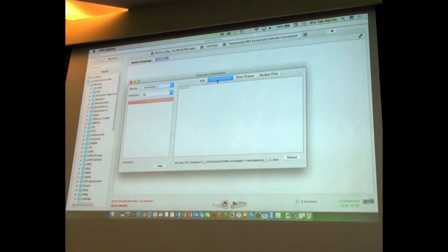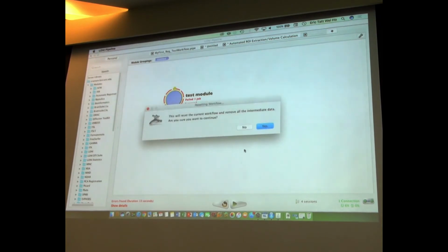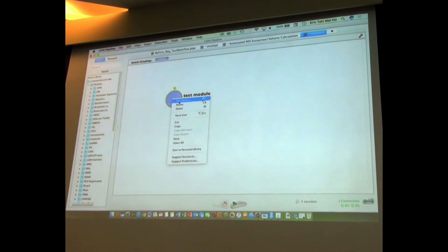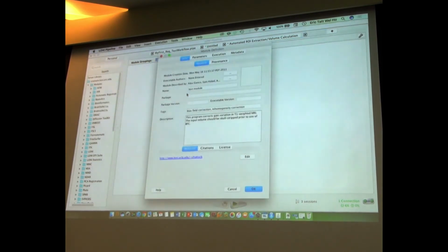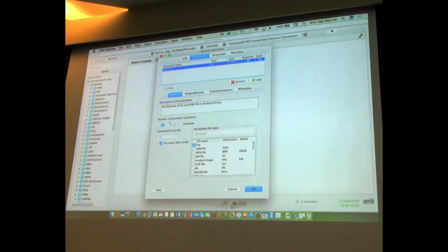That's why copy pasting does not work directly. What I did is I left in the flag of the parameter, which was not right. So I need to go back and remove that -i flag that's defined for this input. See the -i flag?